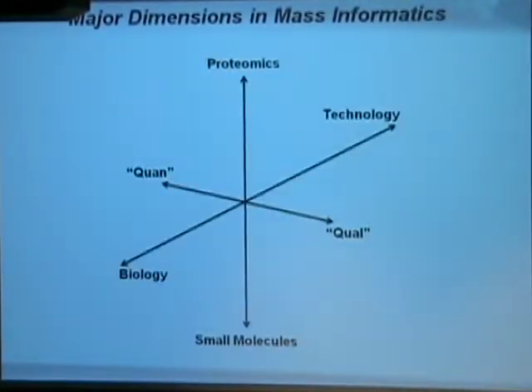Mass-informatics. The premise of this talk is that mass-informatics is a topic that deserves its name in the same way that there's bioinformatics or clinical informatics. And I'm going to try and show that since there's a diversity of axes at the center of which are spectra, it deserves its own topic. But a side effect of doing that is that I won't be able to cover all of these. So, I will try, and this thing will get a little scattered really quickly.